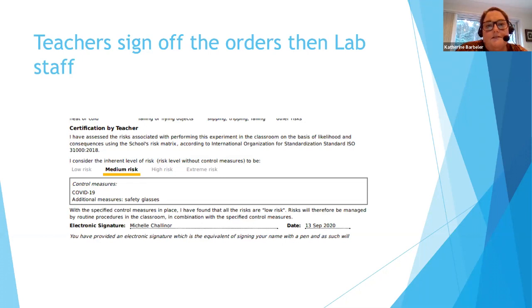So somebody that is teaching chemistry has been assessed by the Department of Education to actually have the qualifications to teach chemistry. If somebody was trying to do a chemistry experiment and the risk went above medium, it probably wouldn't happen, or we'd get a colleague who actually has that chemistry qualification to do the experiment with the students. So low and medium is where we sort of target.